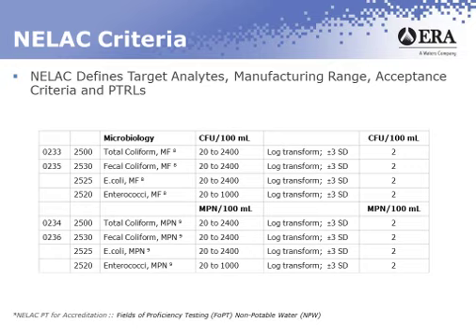In any given one study, we may be designing the PT sample to fall towards the low end of that range, the mid, or the high. It's a requirement that our accreditors will look at to make sure that in fact we're doing that. We can't always make it at the same level. So depending on what study you're enrolled in, you may find something that's lower or higher.